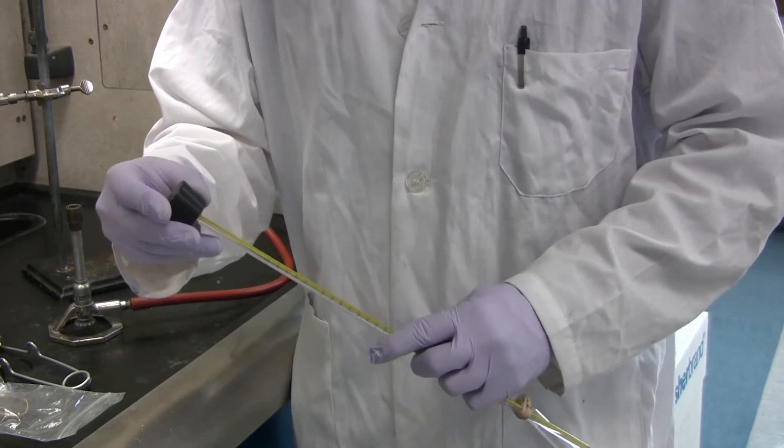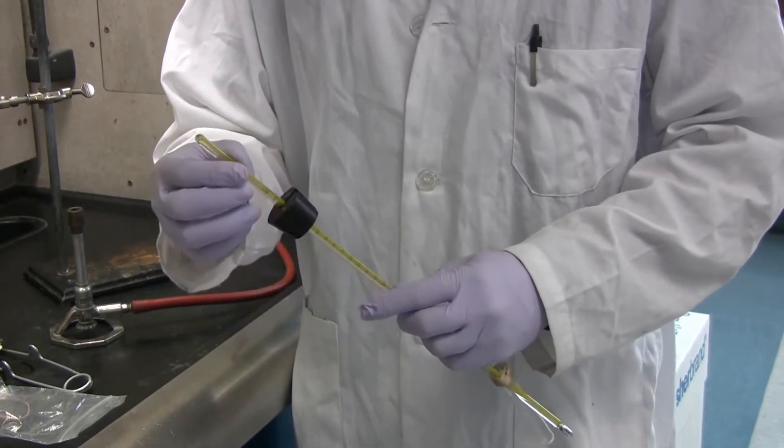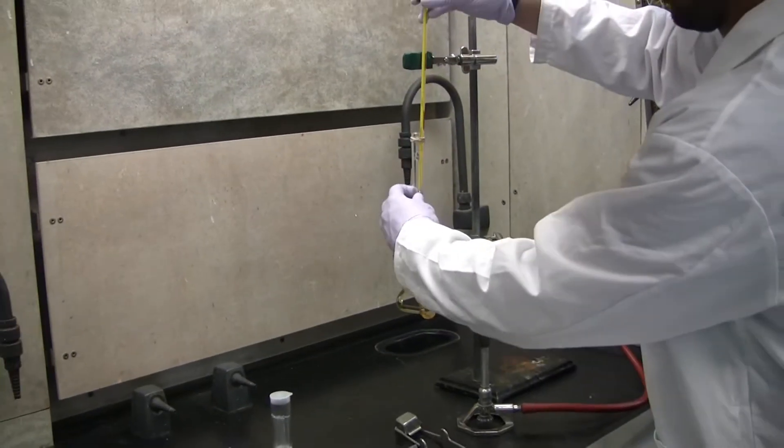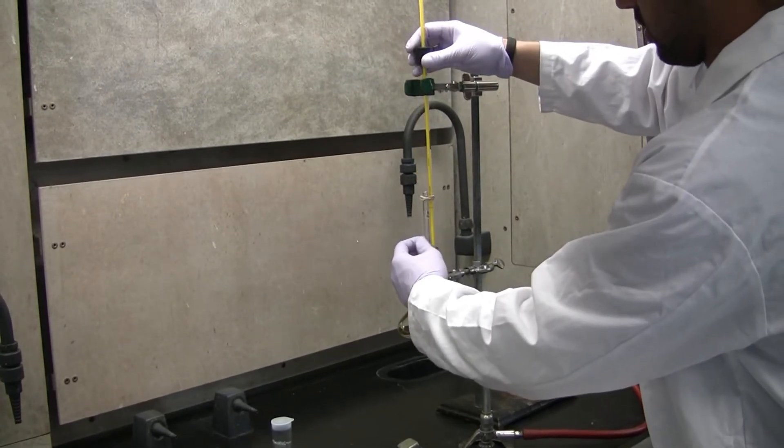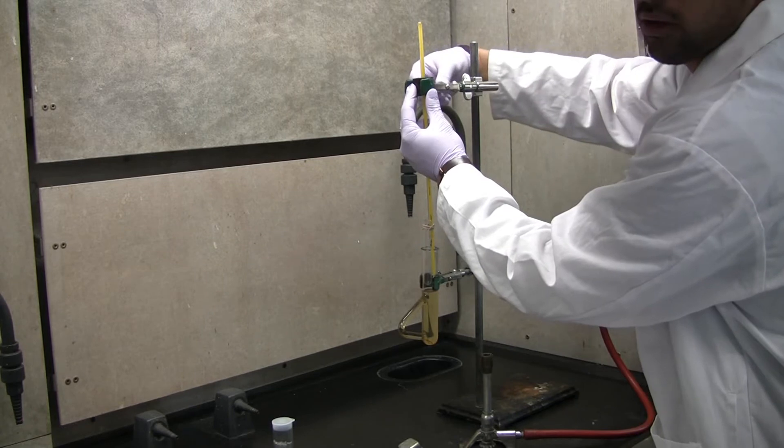Now, place the rubber stopper on top of the mercury thermometer. Place the rubber stopper into the clamp. Make sure it is securely fastened.